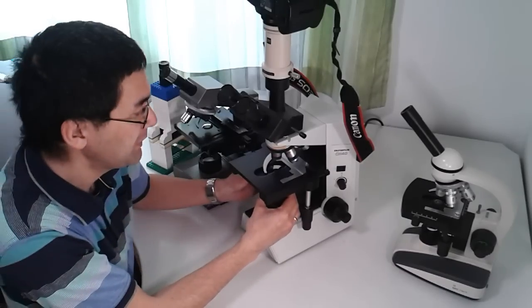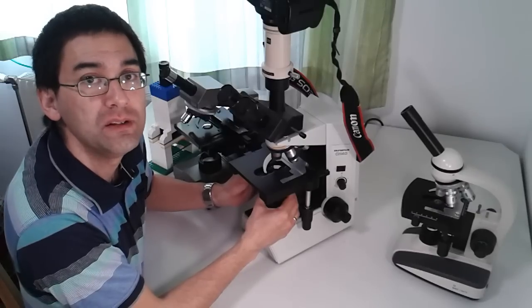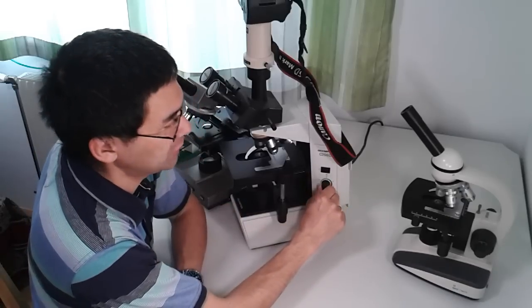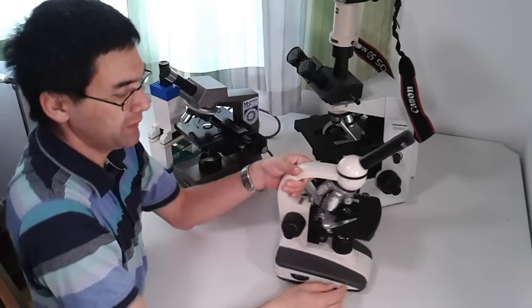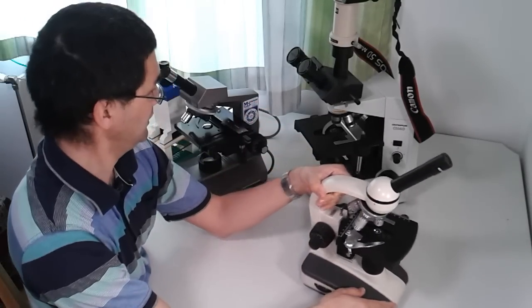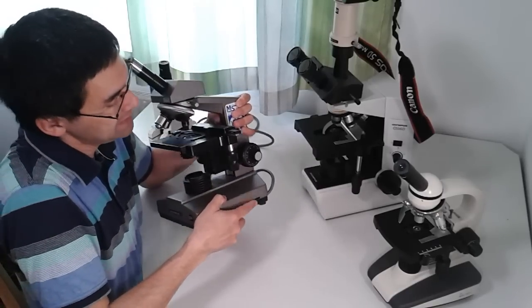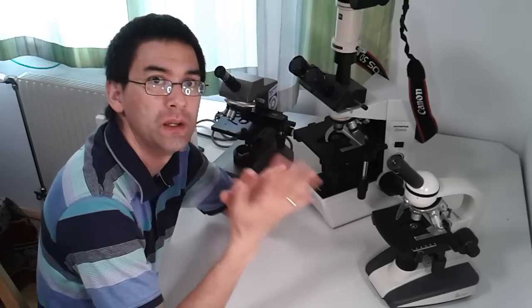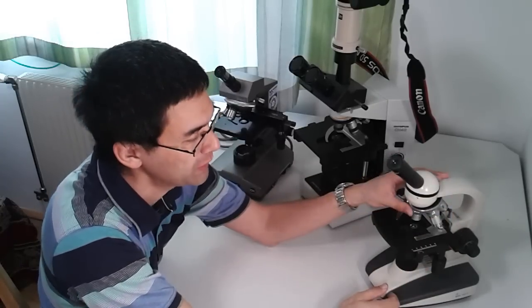All three microscopes also have a filter holder, which is important because it allows you to place dark-field patch stops into the condenser, enabling different contrasting techniques. Additionally, all of them have a light intensity control — on one microscope it's a knob, on another a wheel, and on the CH-A it's a slider. Light intensity control is very useful because different objectives require different light intensities, and it's especially important for photography through the microscope.